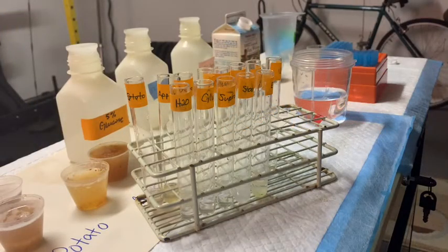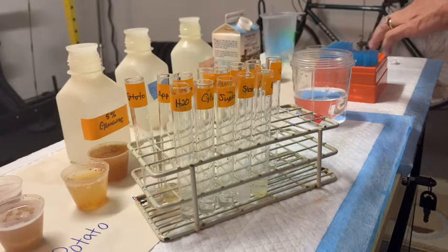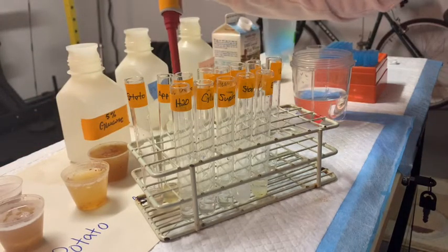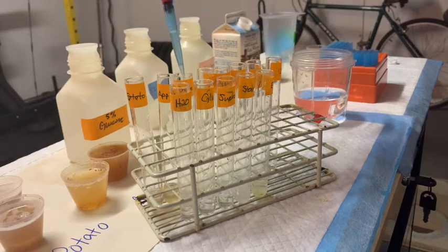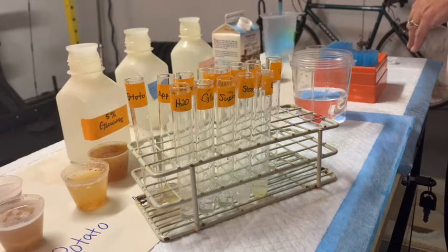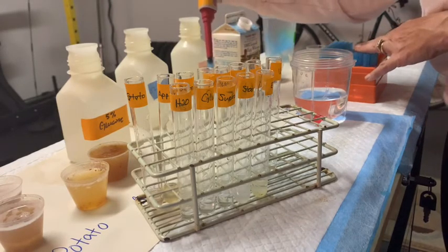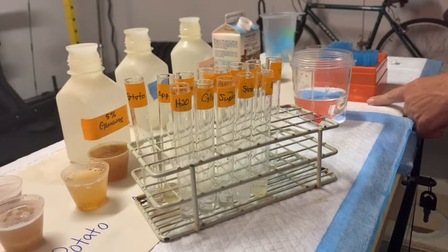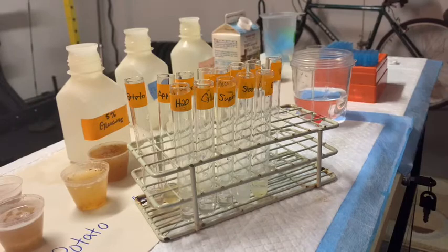Having added one mil of the controls to the correctly labeled tubes, we're now going to add one mil of our food juices. These juices have to be relatively dilute, so they are ground up in water, and then a little more water is added to make them more liquid. We've done potato and apple already; we're now going to add one mil of our onion using our P1000 pipette set to 1000 microliters. Then eject the tip, get a new tip, and we'll move on to one mil of milk — whole milk — then the peanut smoothie, and then our unknowns.